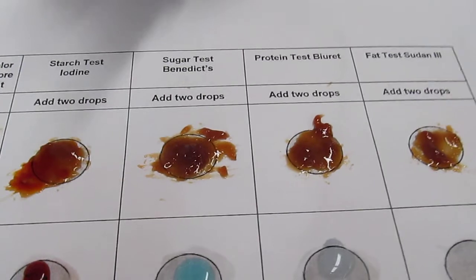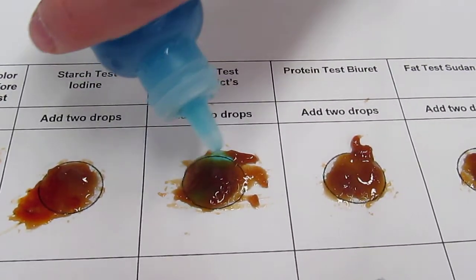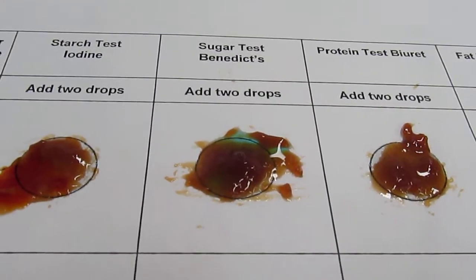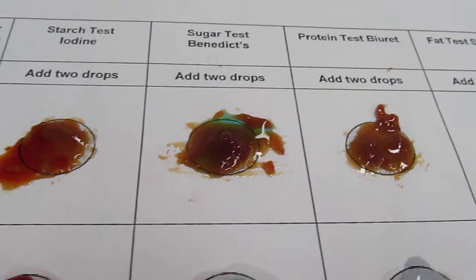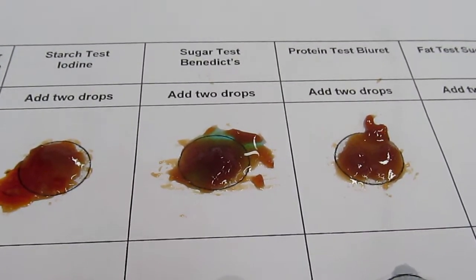Who's got the Benedict's? So the Benedict's is what color to start with? It's like this. I don't know if that's because of the color behind it or not, but it seems to be changing color a little bit — it's kind of green right there. So if it went from blue to green, what does that mean? It has sugar. It has sugar, okay.